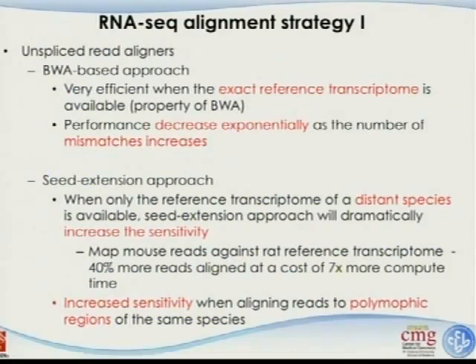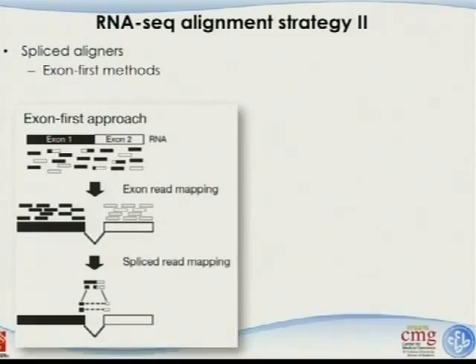One example is that there are so many different rat strains or mouse strains. If you study something that uses Brown Norway, you are probably in good shape because the reference genome is Brown Norway. But if you use another rat strain, you may want to evaluate that a little more. In our practice, we also observed that BWA produces a much lower number of reads compared to BFAST. So those are the choices you have to consider.